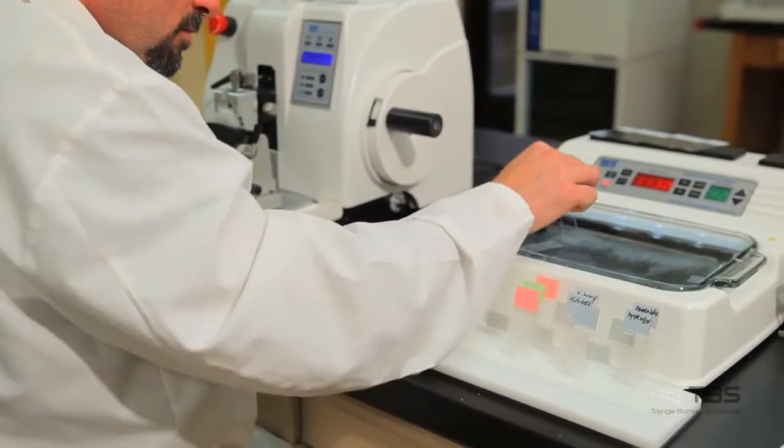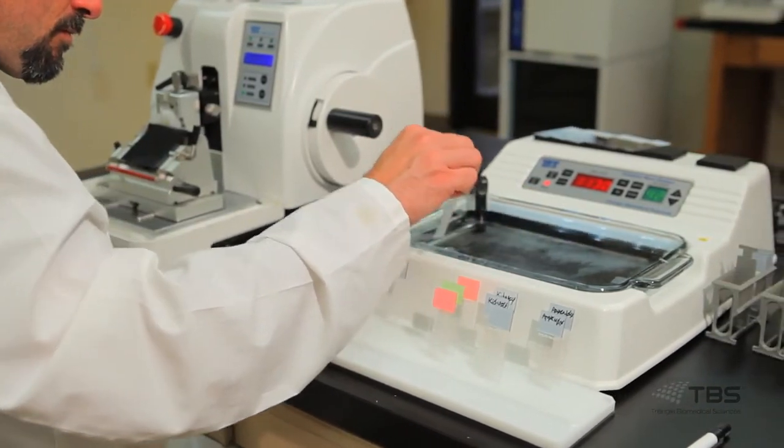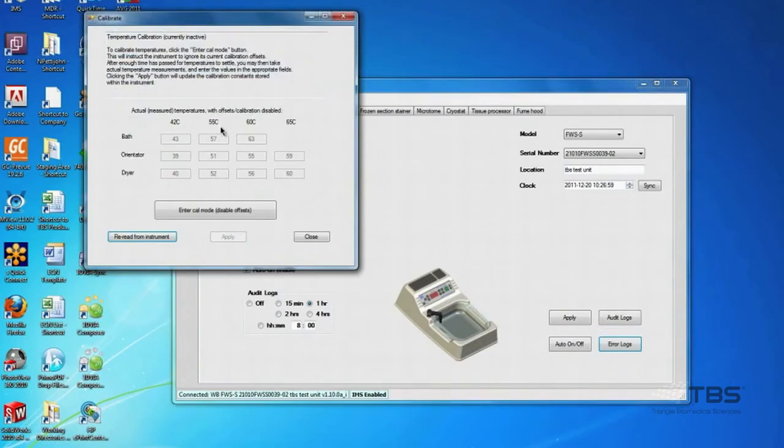Accessories provided include optional slide drying racks which can be attached to the front left or right side of the baths, and also TBS's instrument management software which allows the lab to manage automatic data logging, scheduling, calibration, and quality assurance.